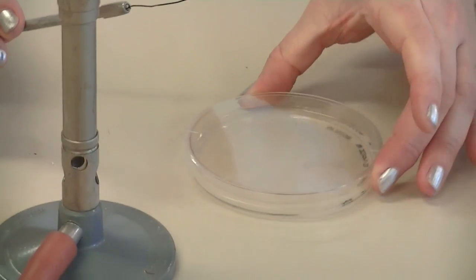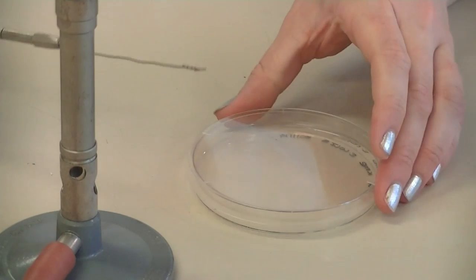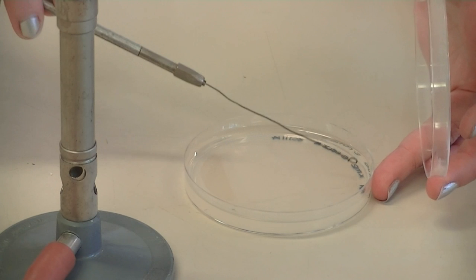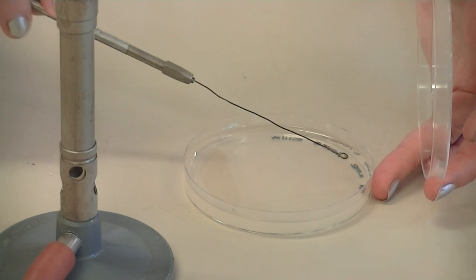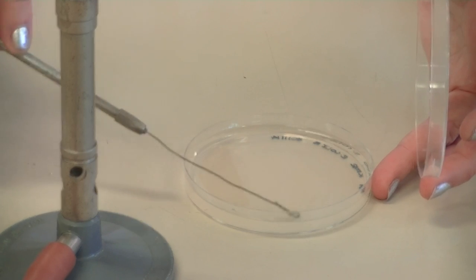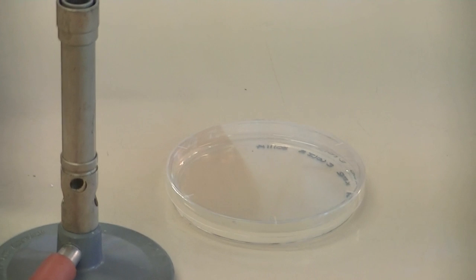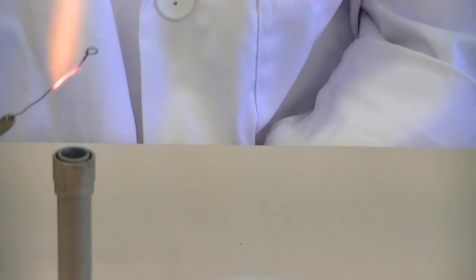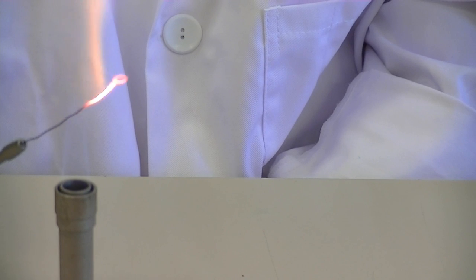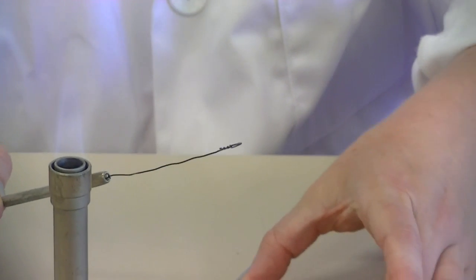Now my loop is cool. I'm going to intercept those primary set of streak lines — touch the loop to the surface to make sure it's cool enough and then intersect the primary streak lines, touching and then lifting off to create four individual streak lines on the plate. Then flame the loop again to remove any excess cells and turn the plate.